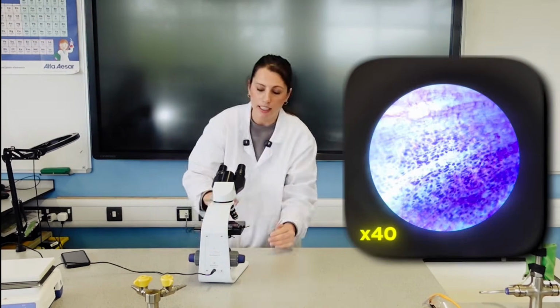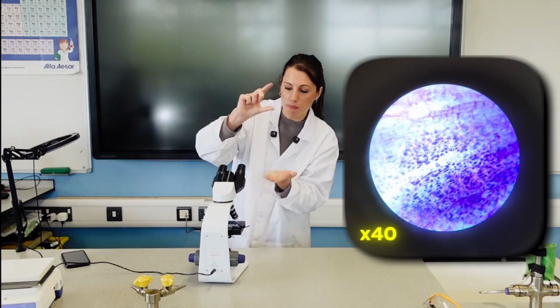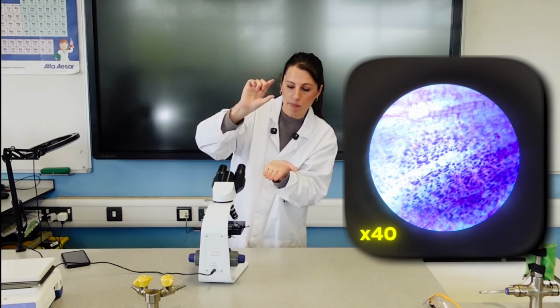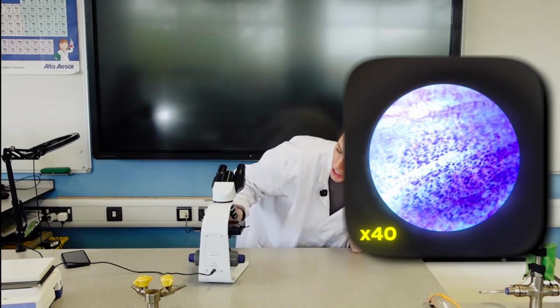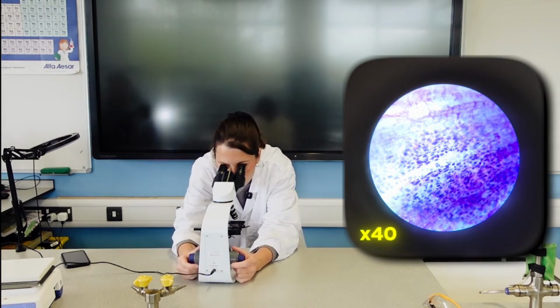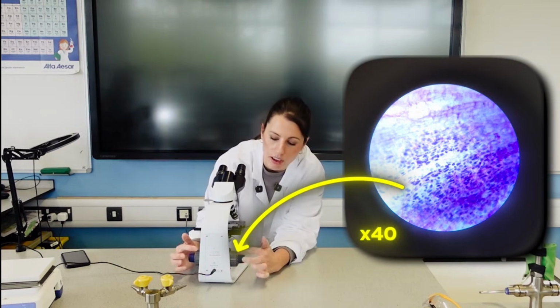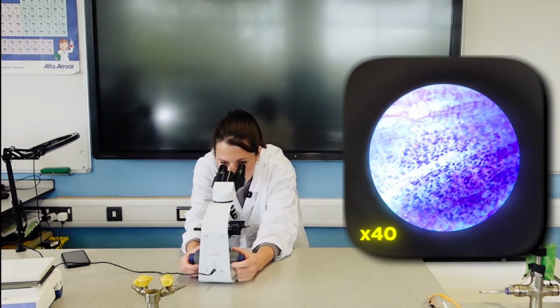Do let the students know that they need to be careful that each of these lenses is longer, so they need to make sure that they don't accidentally move the lens down and crush your slide. So that's why I was just checking from the side, making sure there was space. So then I'm going to have another look, and I was using these dials here, which are like our coarse and fine focus, to get the image into focus.